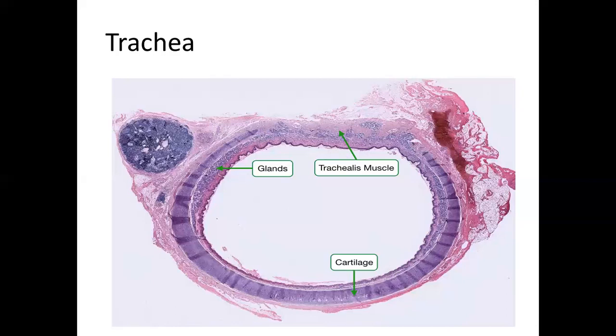Now let's start with the first thing: the respiratory epithelium. At the respiratory epithelium of the trachea, it has 6 types of cells. In the olfactory epithelium we mentioned we have 3 types of cells, while at the respiratory epithelium we have 6 types of cells. What are these 6 types? They are goblet cell, ciliated cell, columnar cell, basal cell, brush cell and serous cell. Okay. And the last thing we have is the diffuse neuroendocrine system.